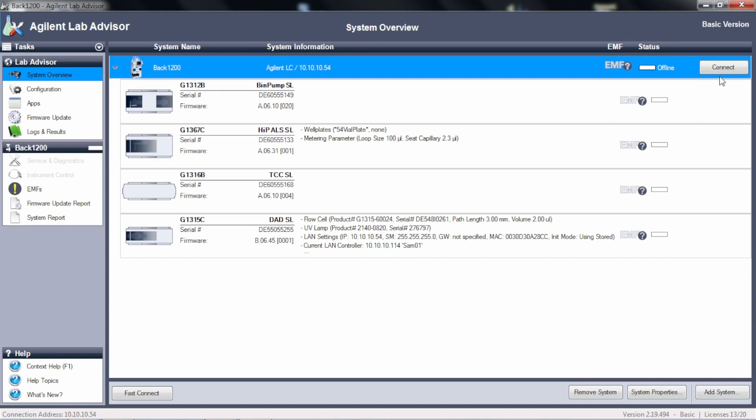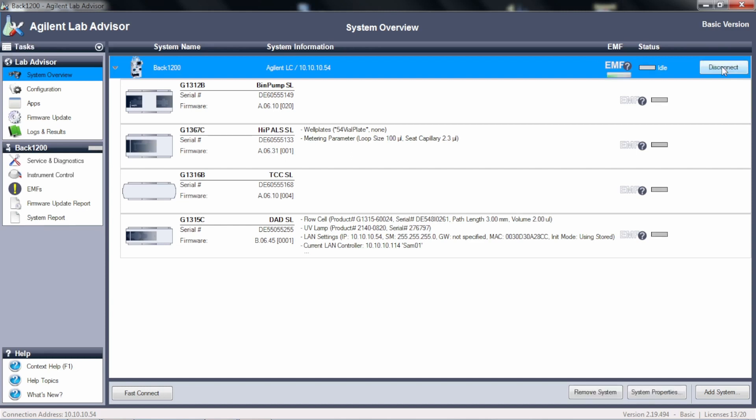So the first thing we got to do is tell it to connect. It's looking for the IP address of the instrument. And once it connects, it will then be in control of the instrument. So it's found the instrument, it's in control.